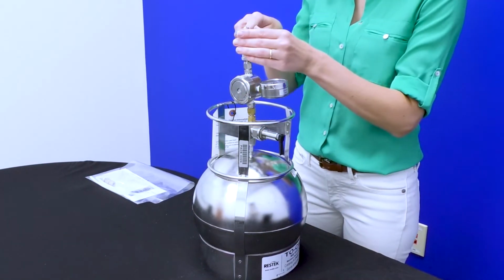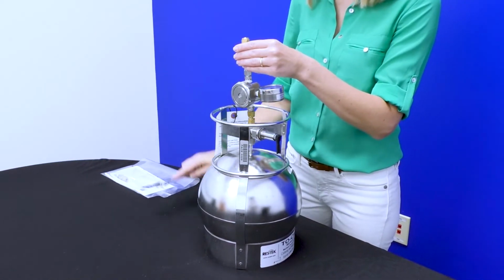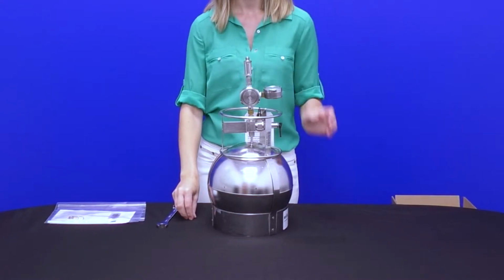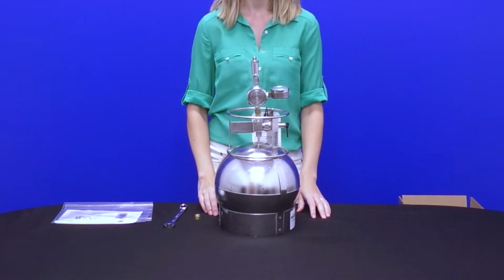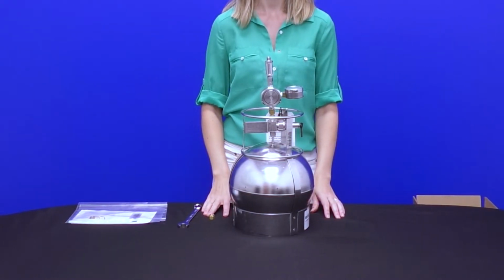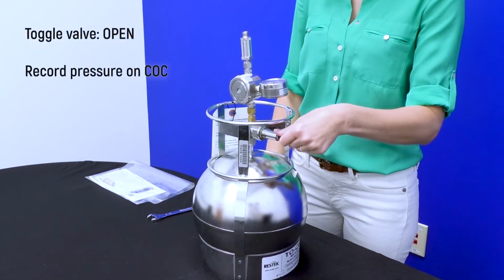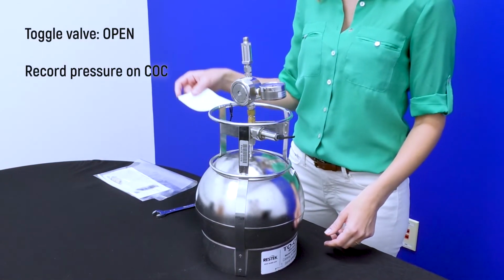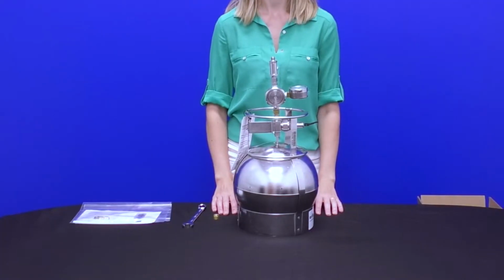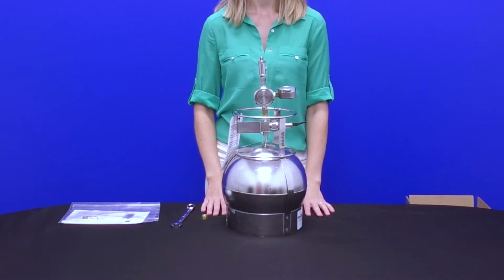When you are ready to sample, you can remove the brass cap from the top of the sampling assembly by turning counterclockwise using a 9/16" wrench. Make any tubing connections needed using the provided fittings, ferrules, and nuts, and conduct any desired leak checks between the can and the sampling point. Open the canister valve to begin sampling and record the initial vacuum on the chain of custody and attach canister tag. Do not place any stickers or sample labels on the canister itself or write on it.